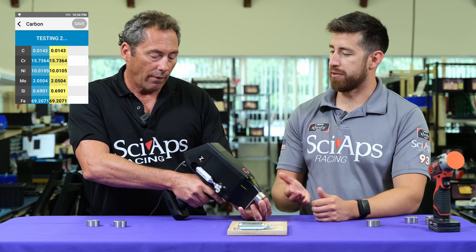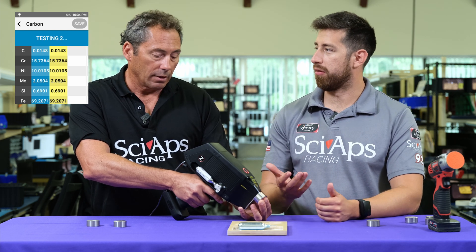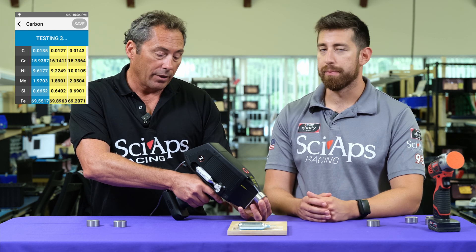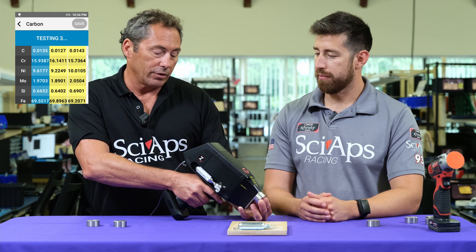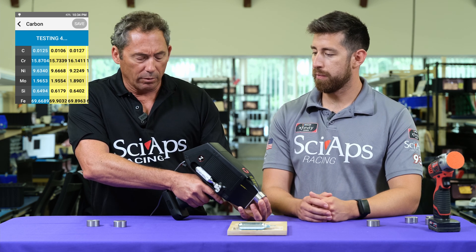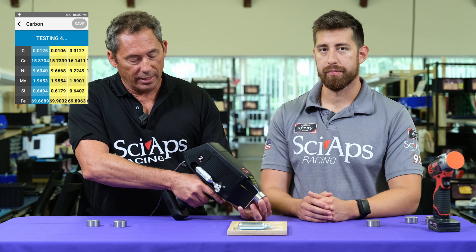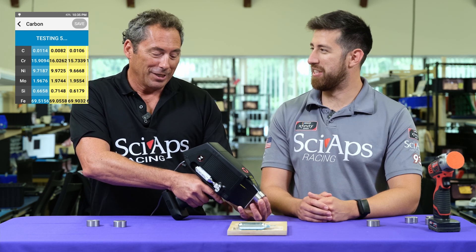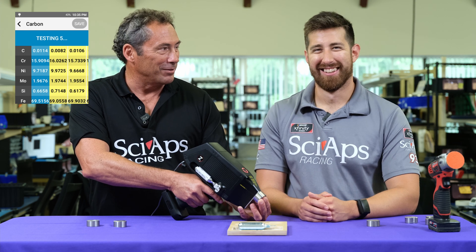Something that surprises a lot of our customers is our limited detection on carbon with our LIBS analyzer. We get down to 0.008 — or lower now. You see this thing is just doing successive tests. On the left in blue is the running average, and then in yellow — or beige, magenta — we see the actual test results.